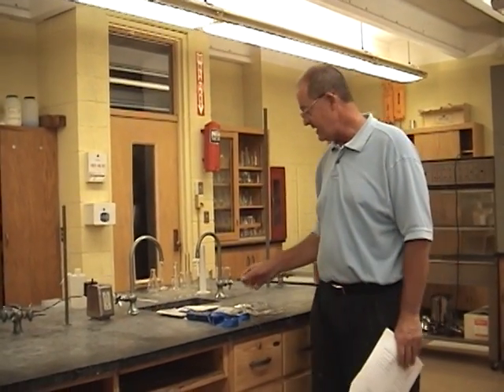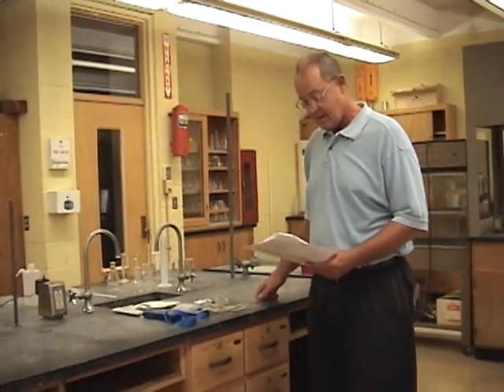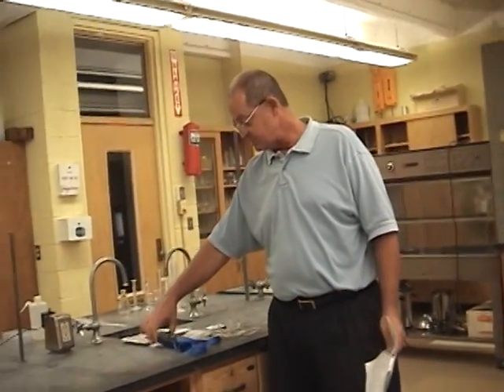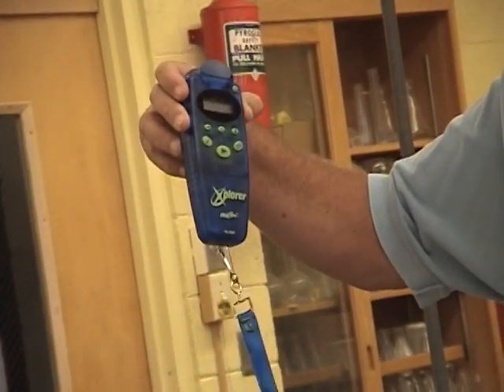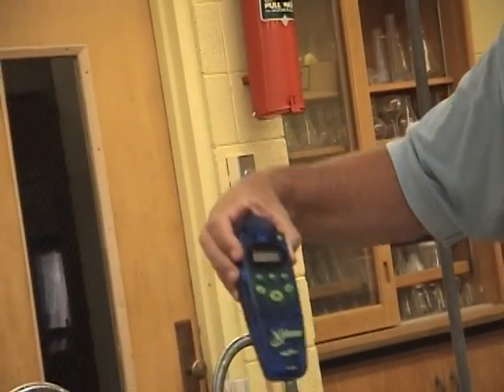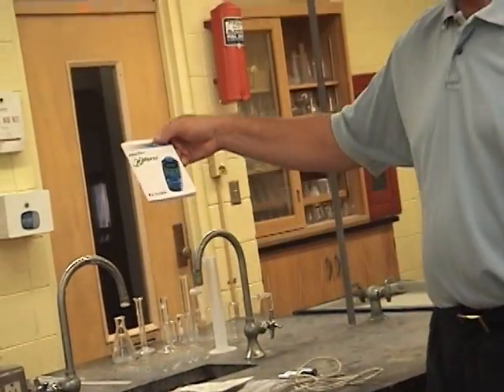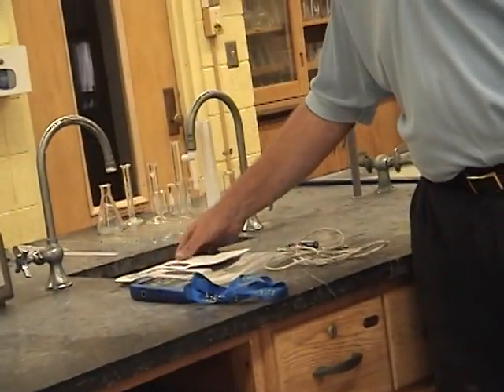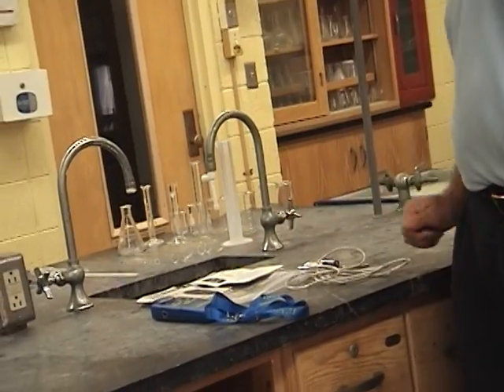I'd like to start showing you the Passport system that is headquartered in drawer 4 and then the associated probes and sensors in drawers 5, 6, 7, and 8. It begins here with the Passport Explorer pack. It's called the PS2000, and it's actually this small handheld device. It's an elaborate voltmeter, and you can even hang it from your neck for individual work with the lanyard. There is a user's guide that explains the use of it and a quick reference guide that will help you get started. It's all stored in a plastic case.